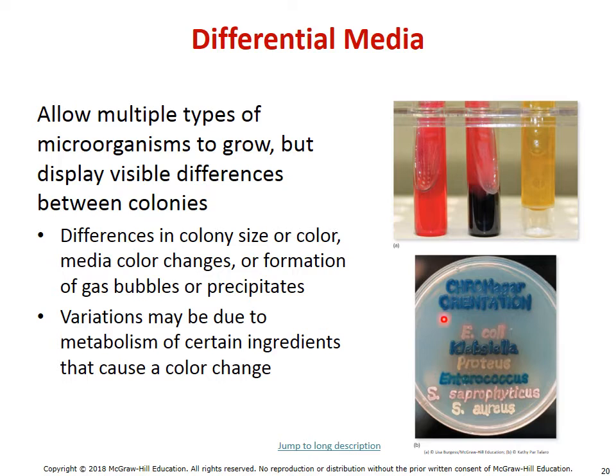So now notice down on this bottom corner we have something called chroma agar. Chroma agar is super cool in that whenever you put a bacteria on the plate, it turns a color. So notice they wrote E. coli. They used the bacteria to write the word E. coli, and thus now you can see E. coli appears as kind of a salmon pink color. They wrote Klebsiella with Klebsiella. That appears a real dark blue. Proteus is a gray. Staph saprophyticus is going to be a very light pink. And so the idea here is we could grow a huge amount of different bacteria, but they all appear unique and different.